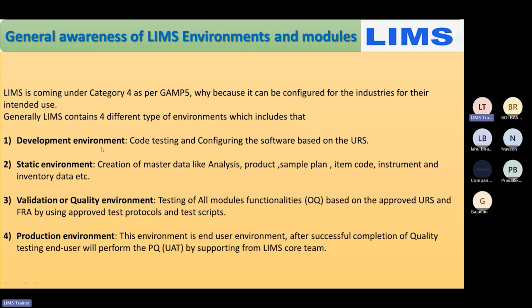After this comes the validation or quality environment. Here, whatever software is developed by the IT industry and whatever static data is created by the laboratory will all be validated. It will be checked in the validation or quality environment. Here there will be some module functionalities, like operational qualification, based on the user requirements. So this is how it will be validated in the quality environment.